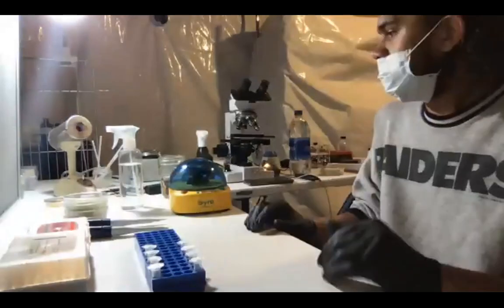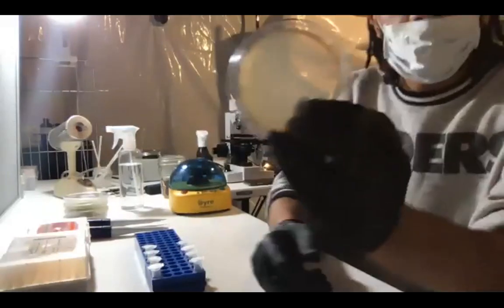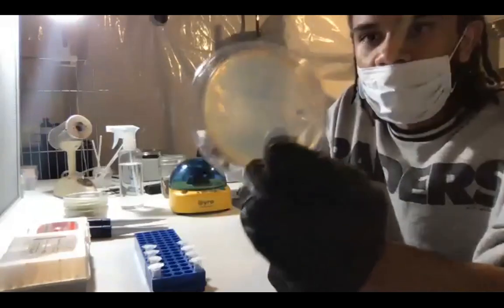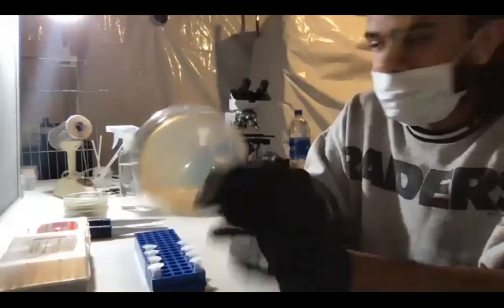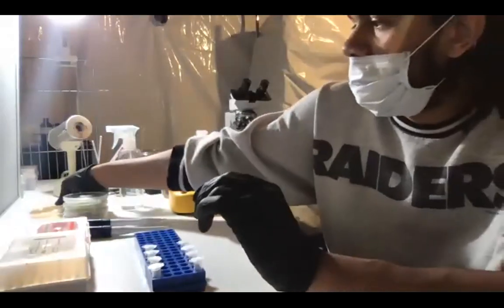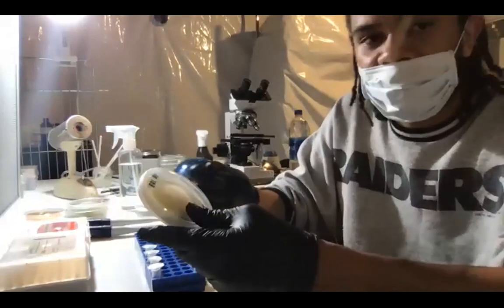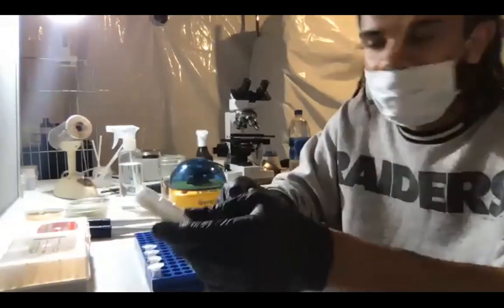All right, so we're gonna go ahead and get started here. I have a blank Petri dish here. I usually use water agar for this, but this Petri dish is just for me to cool off my scalpel. I'm gonna need to sterilize my scalpel between pulling out mycelium so that I can kill the mycelium, so that I don't accidentally breed these with each other and I don't cross-contaminate anything.